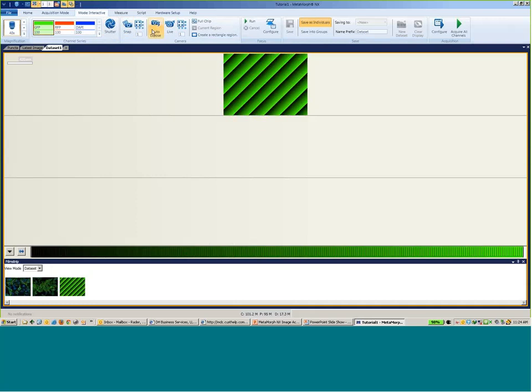So when you hit calibrate, it's going to come in looking for a percent maximum range to fit within a defined area for your field of view. And then you're configuring the number of pulses and the duration, so how long of a pulse it needs to be able to find the spots and so forth. Again, because I don't have the laser hardware set up, I can't really do the calibration. But at least you can see the sequence that's here. Once you've identified the illumination setting for the pulse, now the pulse icon shows up here. So that's the calibration that's done.